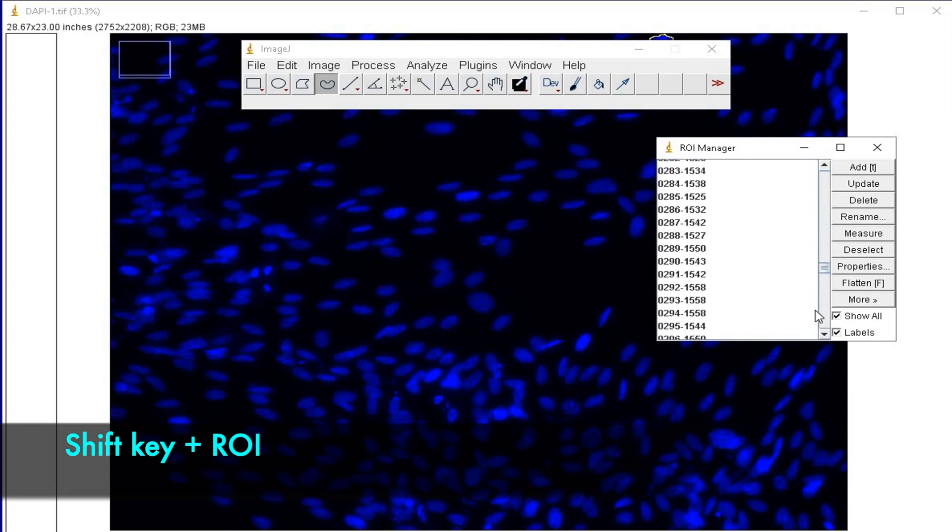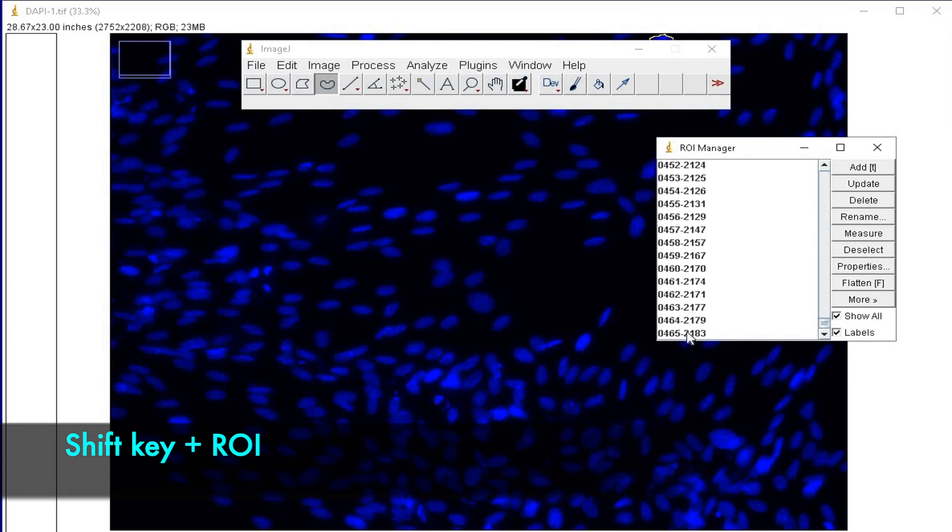Scroll to the last ROI without releasing the Shift key and click on the last ROI. At this stage, all the ROIs have been selected.